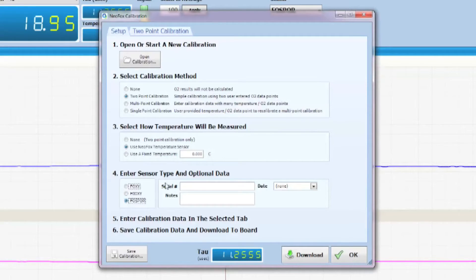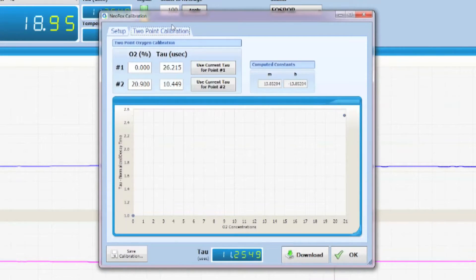After that, you can go into the two-point calibration tabs of the setup box. In the two-point calibration box, you will see a place to put your 0% oxygen reference and your 20.9% oxygen reference. This is also known as 100% saturation at one atmosphere pressure.